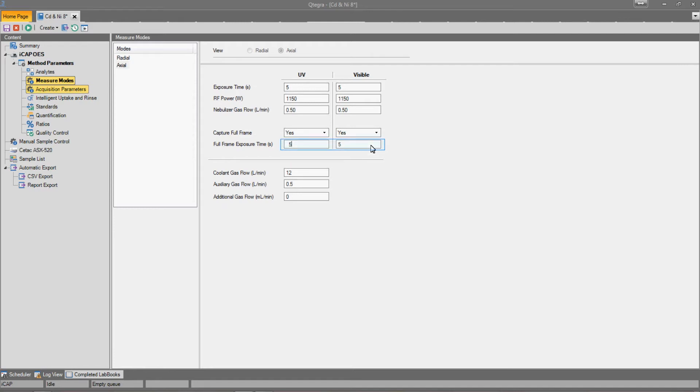We can set integration times for the full-frame images. The default is the time set for analysis, so I will leave them as five seconds each.